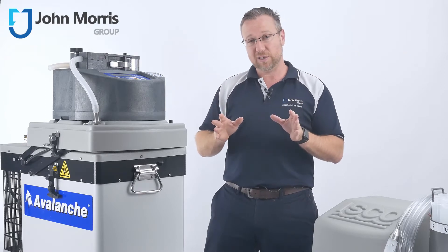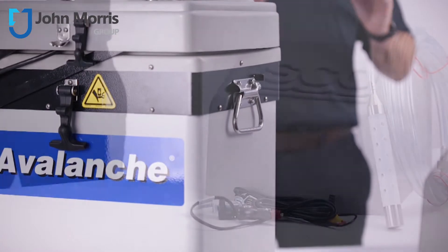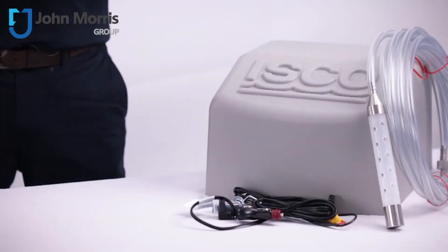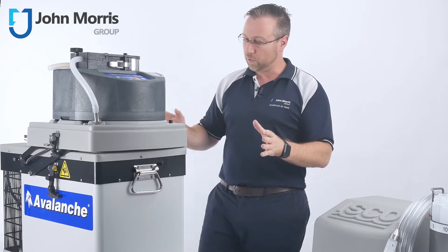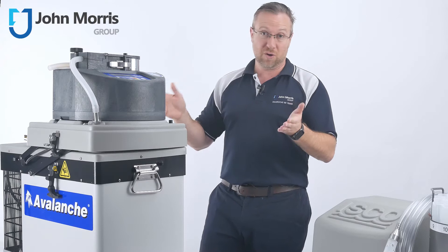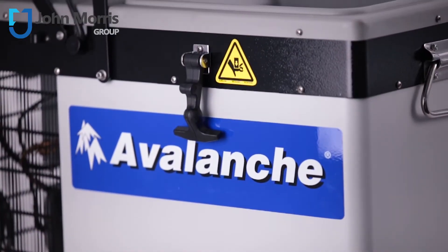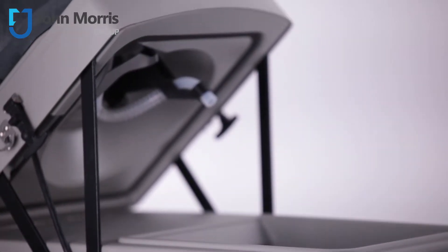Today we're looking at the Avalanche Sampler from ISCO. This is a beautiful little sampler and it's quite unique. The thing I really like about it is that it's the only sampler which is both portable and refrigerated. And not only is it refrigerated, but it can operate off a range of different power conditions — that is AC and DC power.